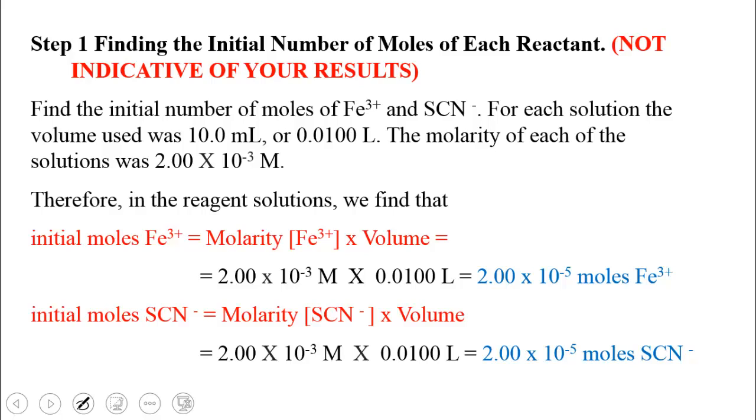Now this, of course, is not indicative of your results. I have used fake data. For example, it says each solution we're going to use 10 mL, and the molarity of each solution is 2 times 10 to the minus 3 molarity.